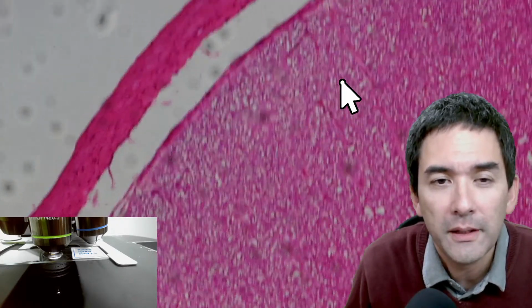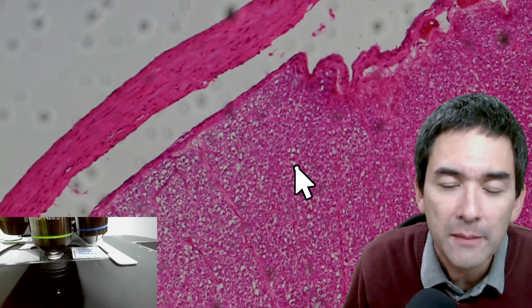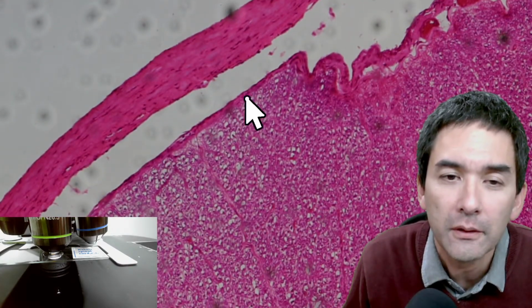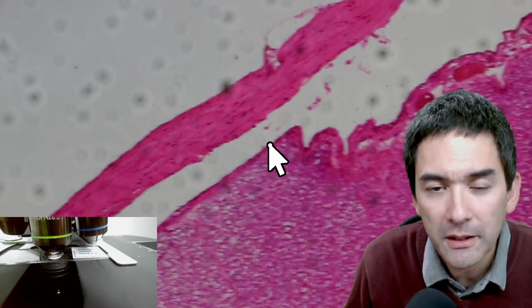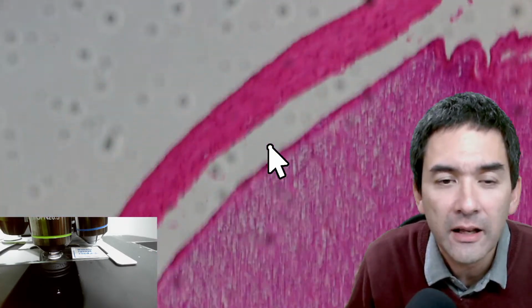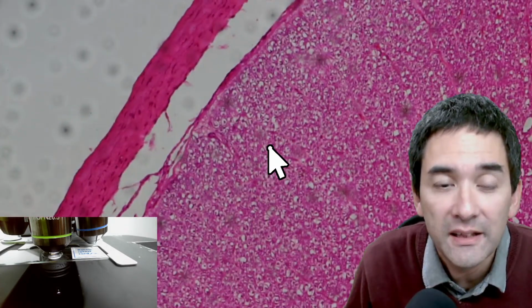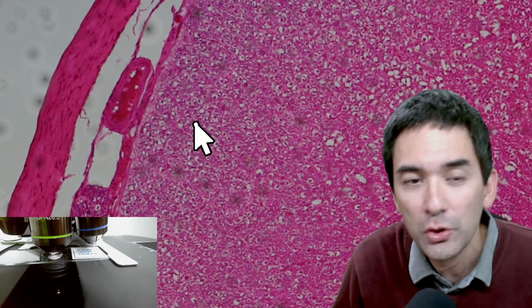So it is quite difficult to see the bacteria if there is so much other tissue present which covers them up. For this reason, certain staining techniques like Gram stains were invented, so that you can stain the bacteria and see them better in comparison to the human tissue.